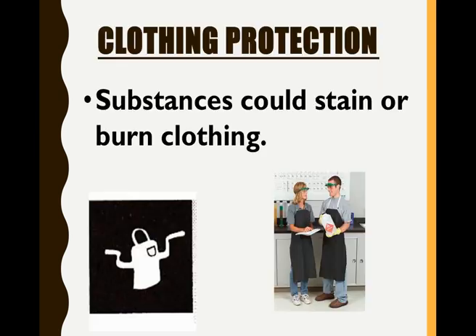When you see this symbol, what does it make you think? What do you think this means? What it actually means is we need to wear either a lab coat or a lab apron, something like that, in order to protect our clothing, because whatever we're working with could stain, damage, or ruin our clothing.